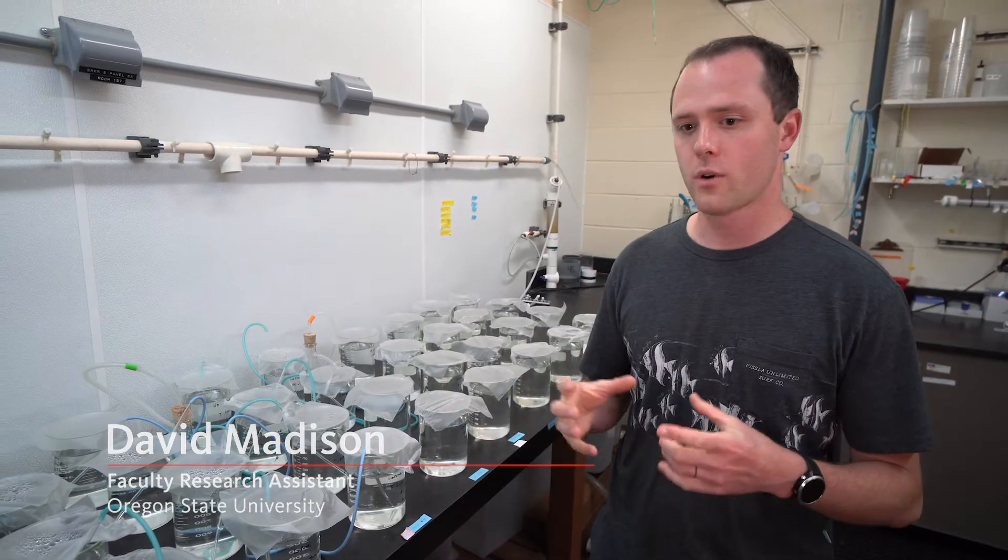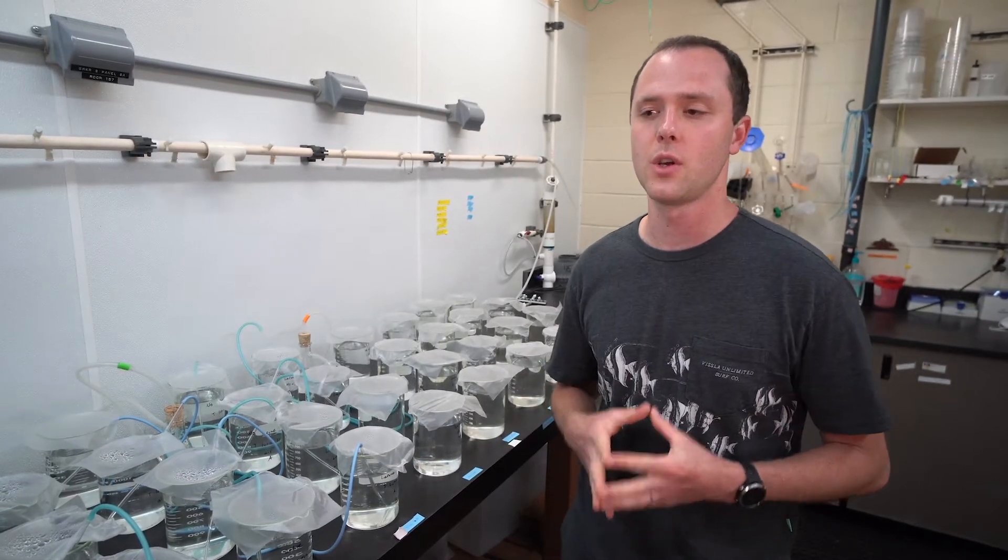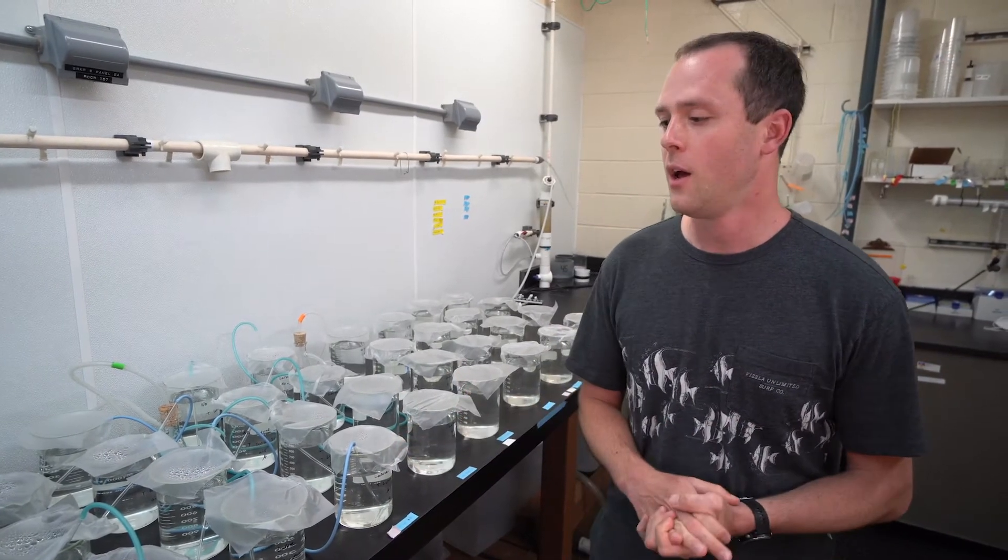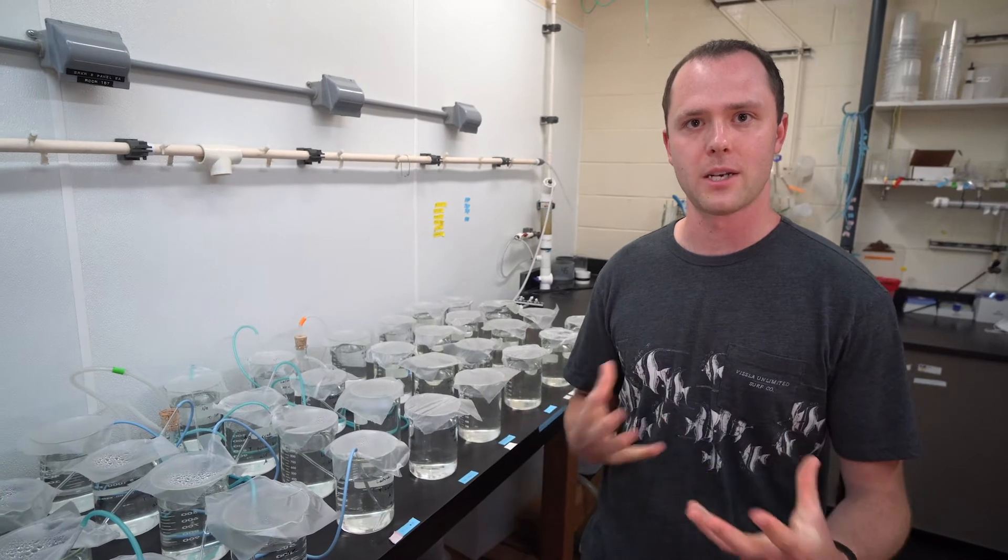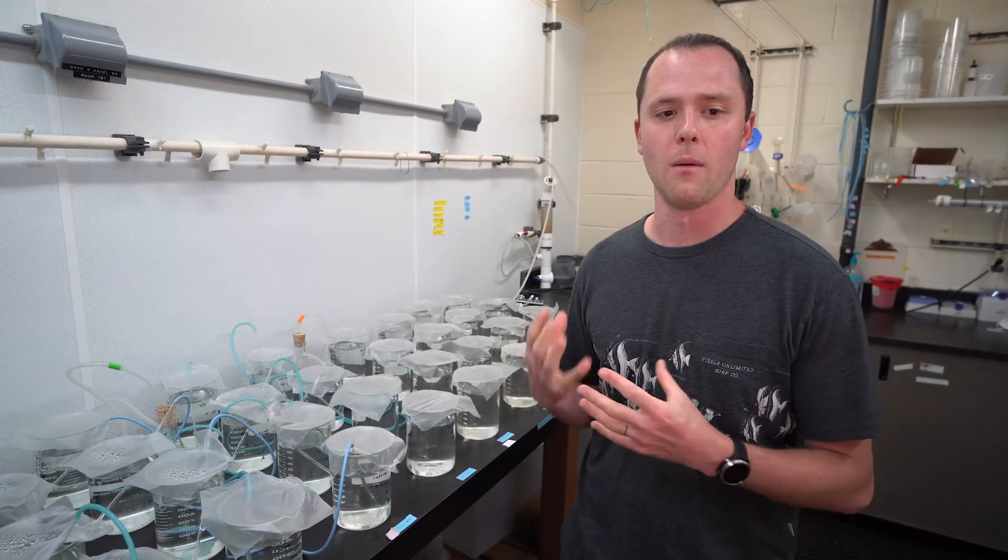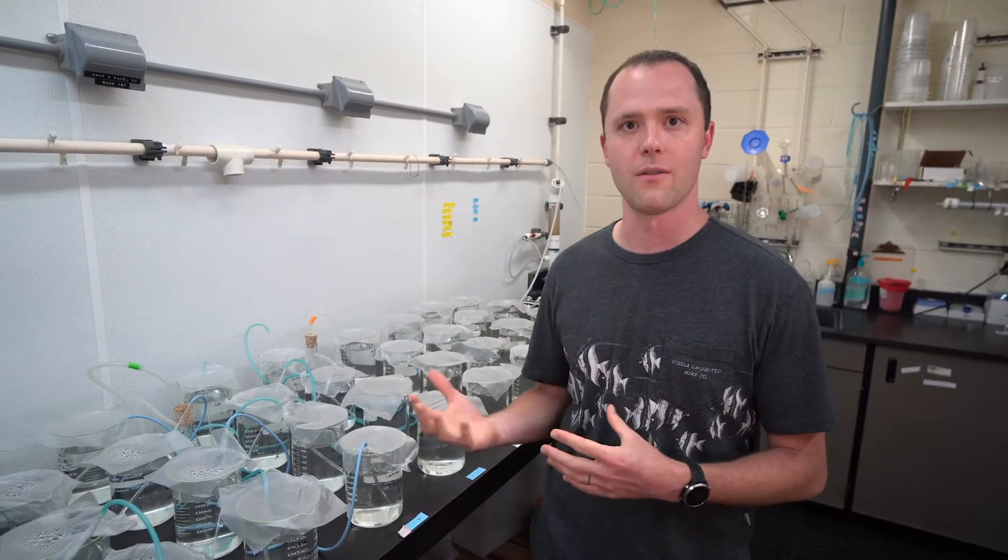I do a lot of work in 24-well larval tissue culture plates, which allows us to do a huge number of treatments per experiment so that we can try and screen different bacteria to find out which ones are beneficial and able to improve larval survival in the presence of pathogens.